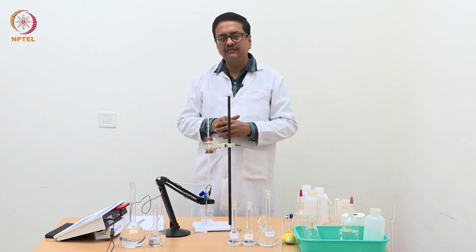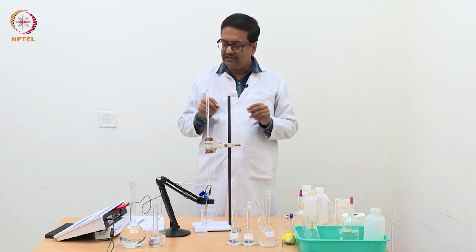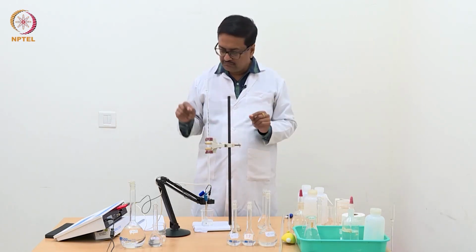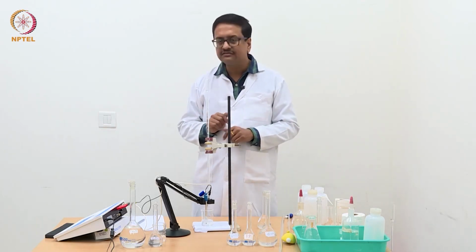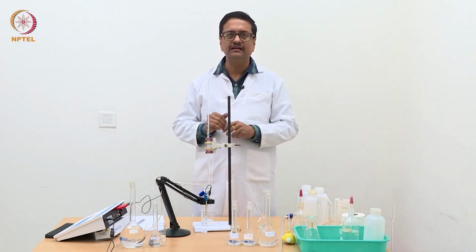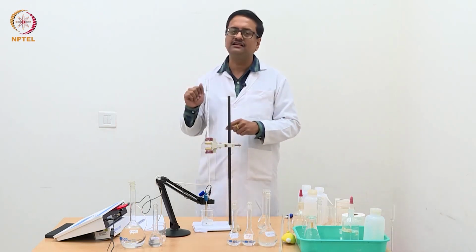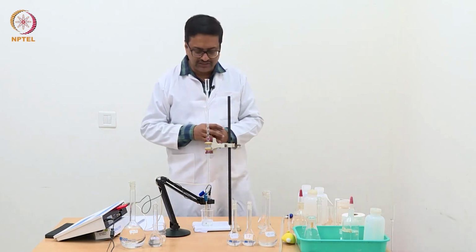So, in this particular titration, we can use a larger volume gap between two consecutive readings, because from the theory we know that there will not be any change in the beginning and there will be a change only when we have reached the equivalence point.